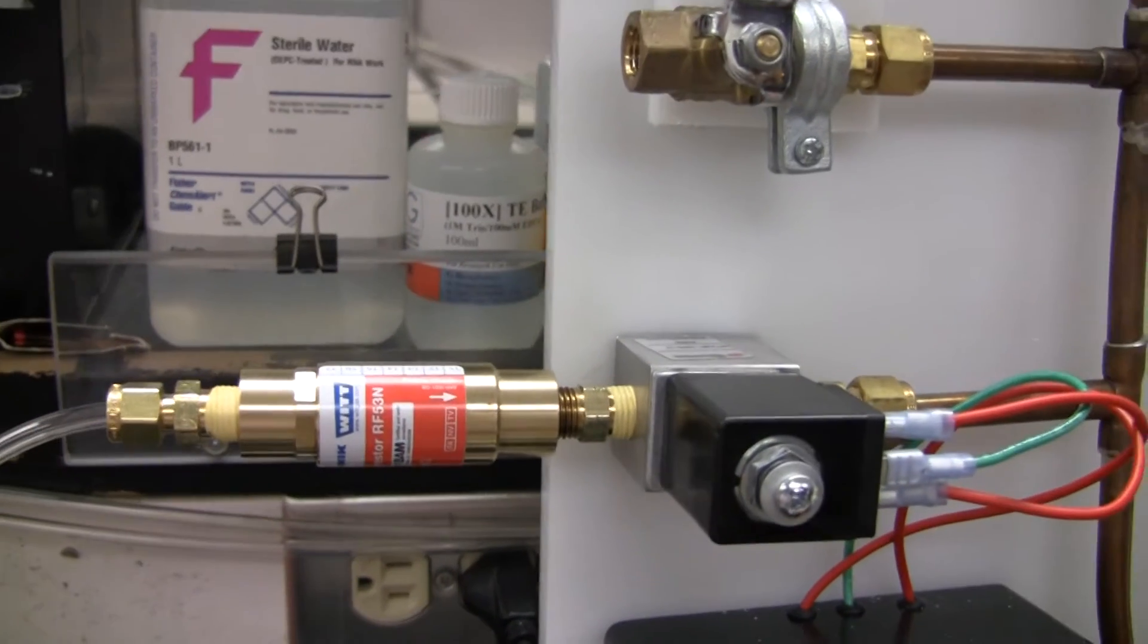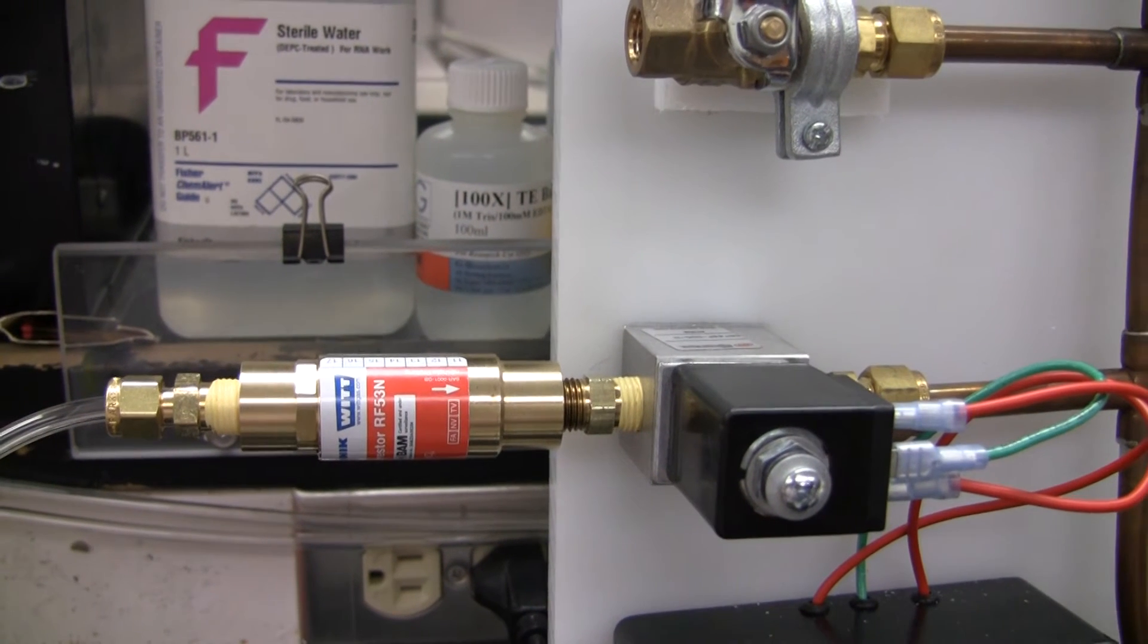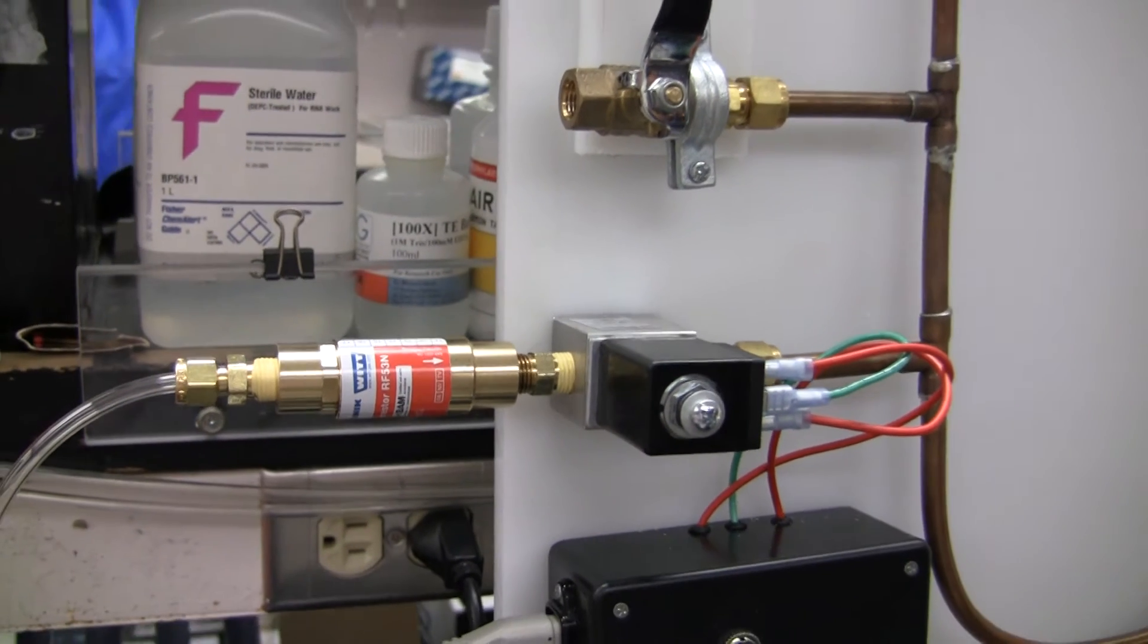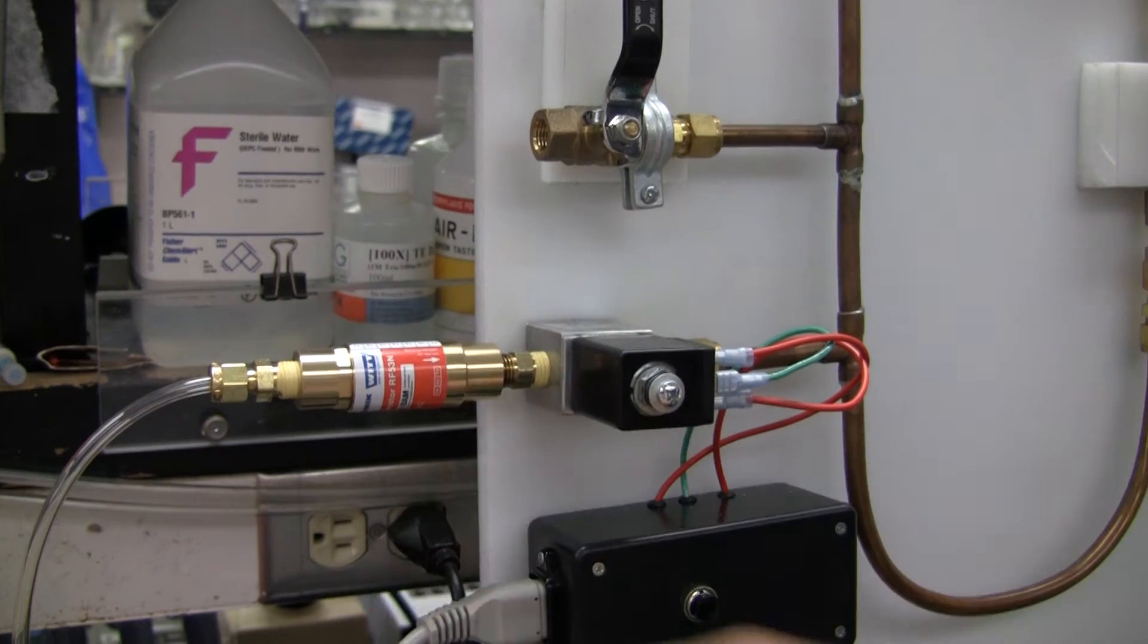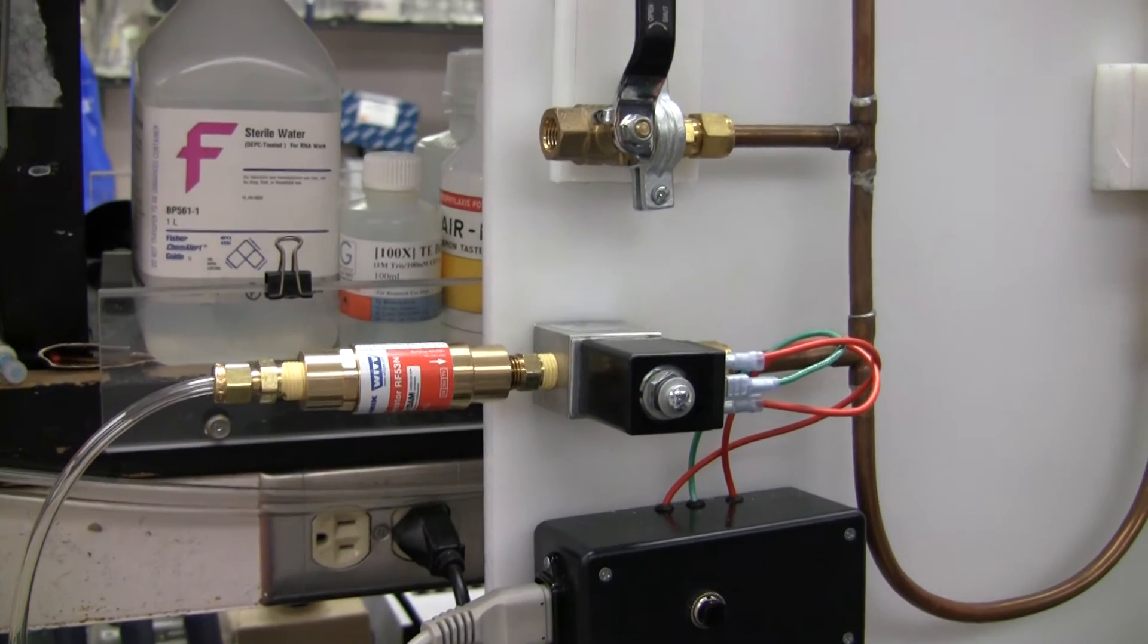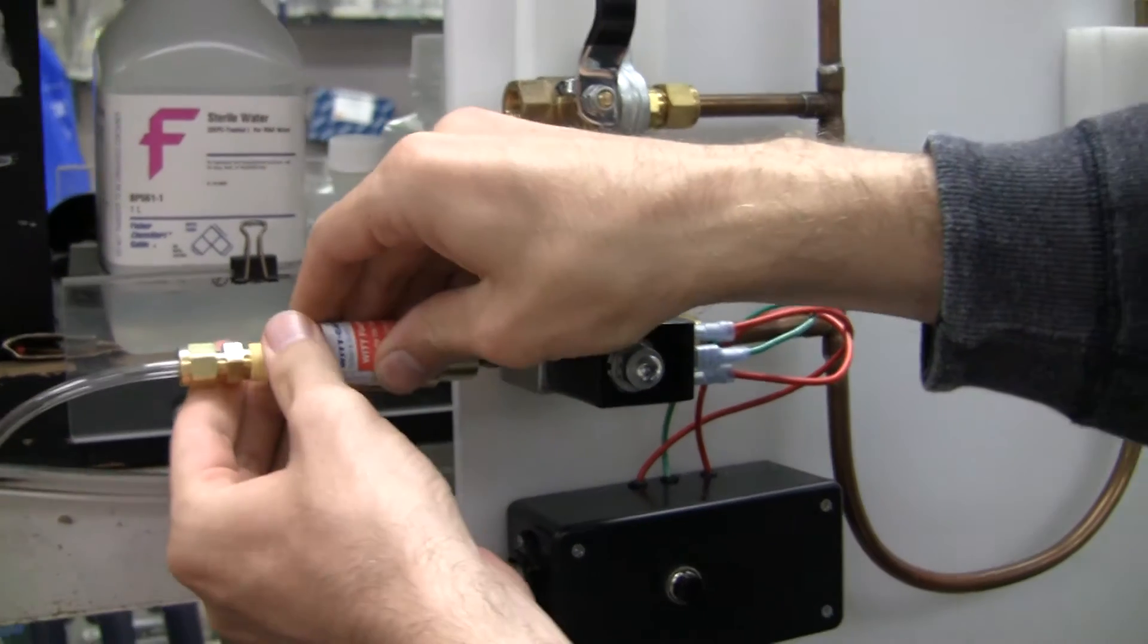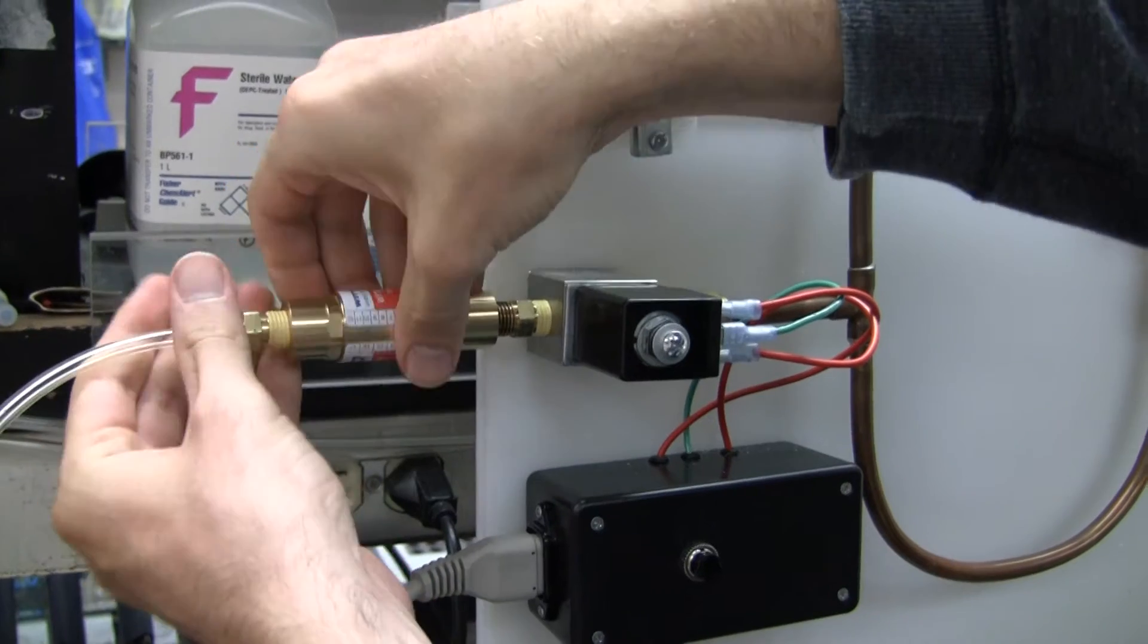We just put a quarter inch nipple on here to fit it to the solenoid valve, and we tested it out and it works beautifully. What's probably going to happen is that we're going to remove this for shipping because it doesn't fit too well in the crate that we had built.